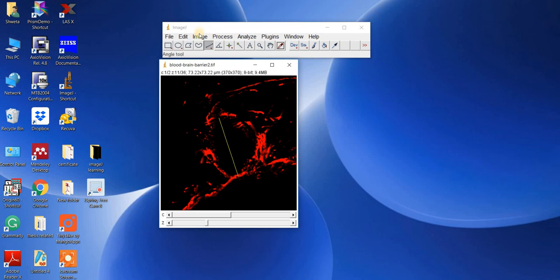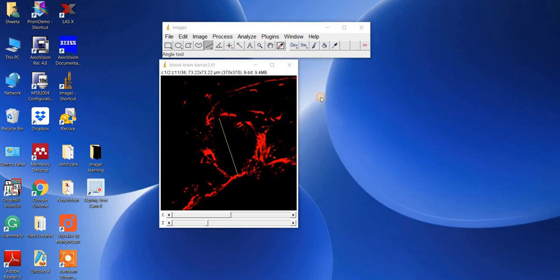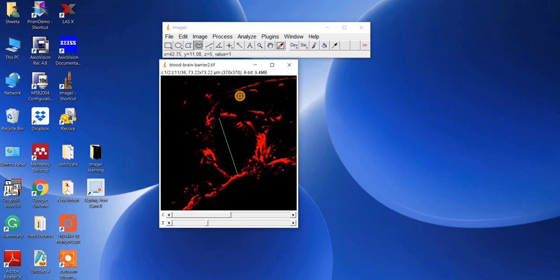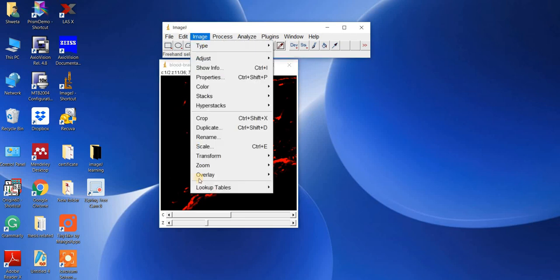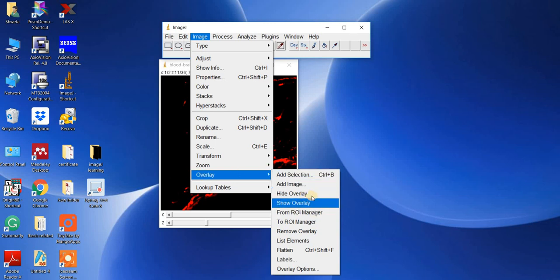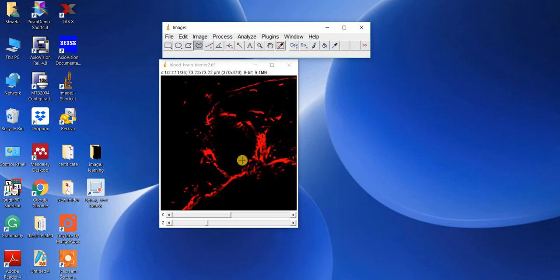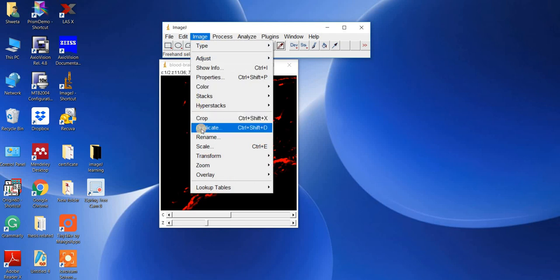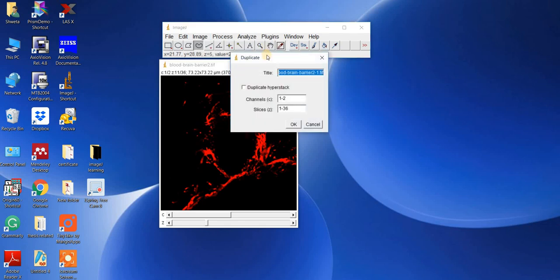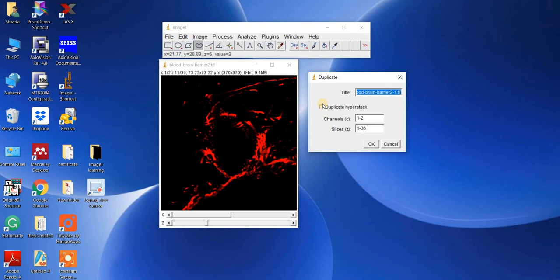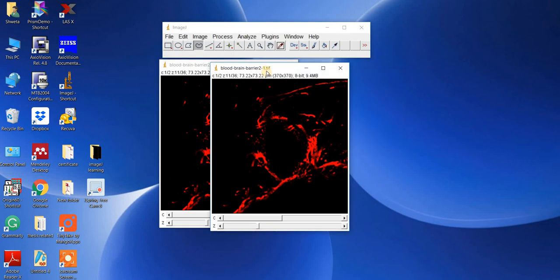Now let's see how to manipulate your images. First, remove the selection you made: go to Image, then Overlay, then Remove Overlay — now it's removed. Before manipulating the image, duplicate it so you can work in different ways. Go to duplicate image — it asks if you want to duplicate the whole slice or specific slices from start to end. I want to duplicate from stack 1 to 36, so I click OK.